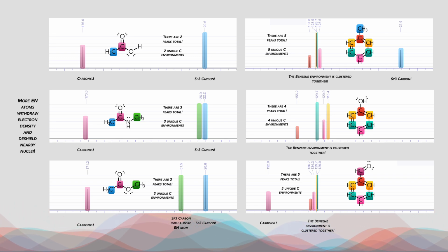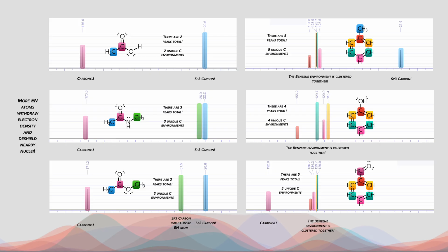Here, the goal is not to memorize isolated values, but to learn to interpret spectra as consequences of molecular electronic structure.